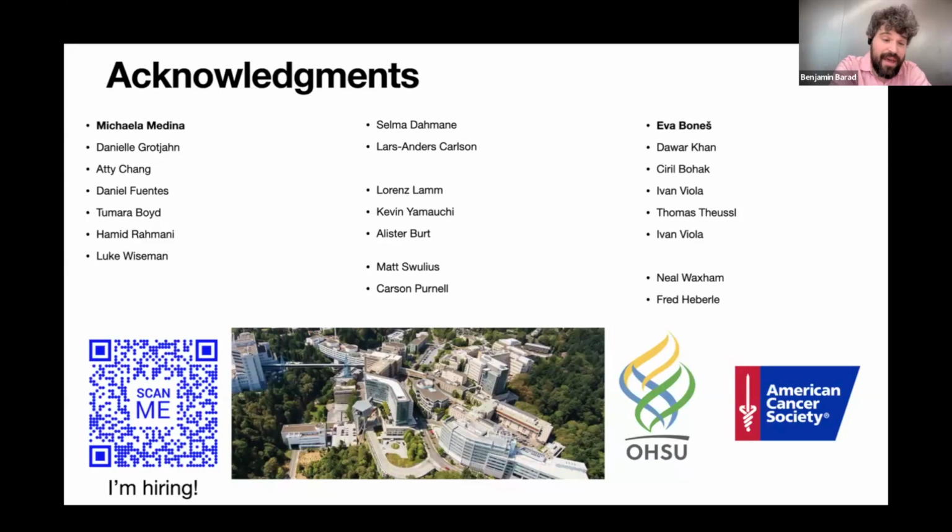The flip side is that the better the tomogram, the less work it usually is to segment. So if you're trying to do a lot of them, it helps to have much better tomograms. But in terms of binning, it's very easy to bin down quite a bit and still get really nice tomograms and really nice segmentations.